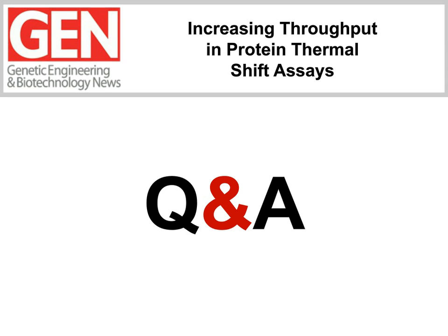Absolutely. So the thermal shift assay as an application came as a second component to the instrument. Initially, the LightCycler product portfolio itself is basically for quantitative qPCR, and it is built for the amplification of DNA and then reporting by probably SYBR Green or hydrolysis probes and hybridization probes for that matter, and capturing that information and providing that as an amplification curve to the user.